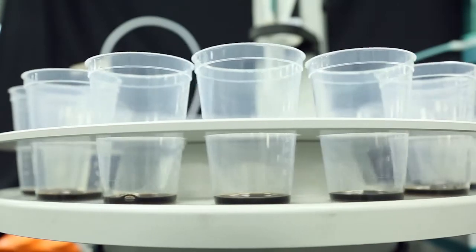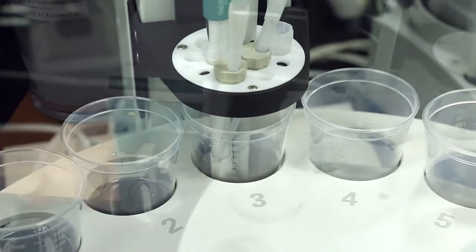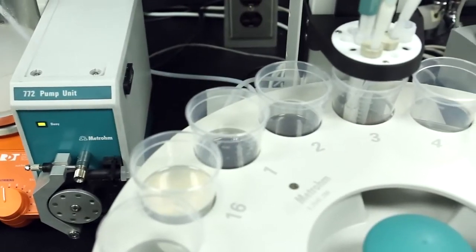Studies have shown very close data correlation between thermometric and potentiometric TAN methods, making implementation into a refinery with historical data very practical.